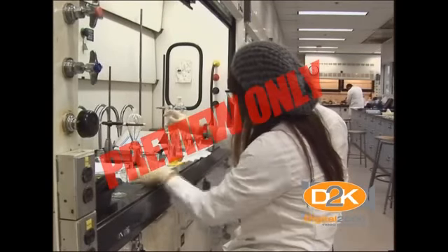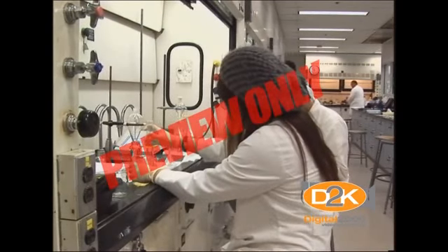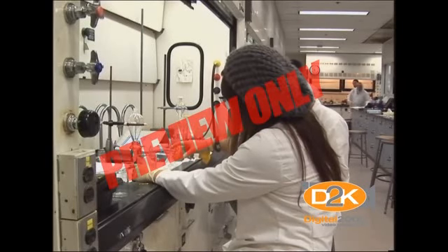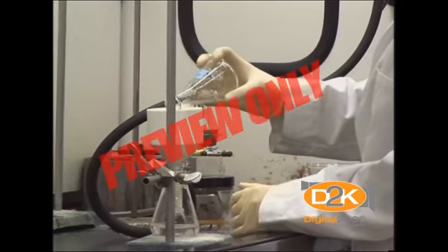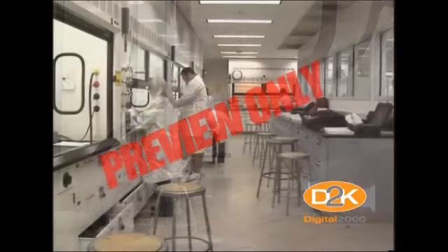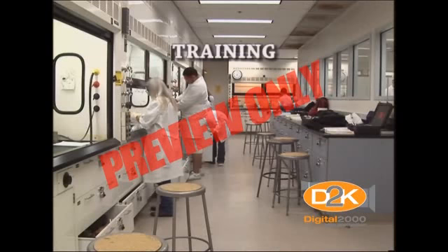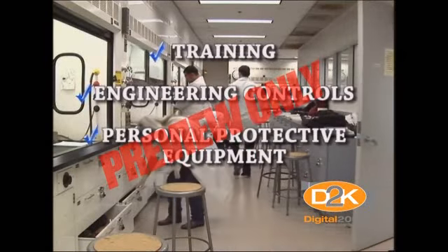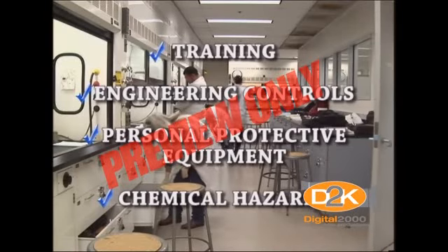In this case, students, staff, and professors are to be protected from the health hazards presented by hazardous chemicals used in your educational facility. In this program, we will cover some of the components of a chemical hygiene plan. These components will include the basics of training, engineering controls, personal protective equipment, and chemical hazards in the university laboratory.